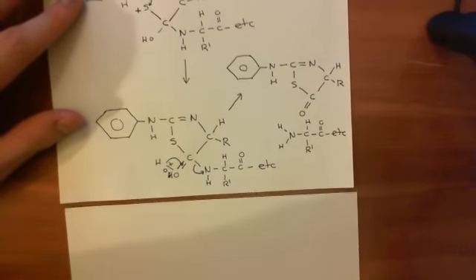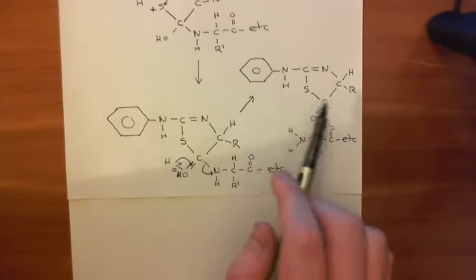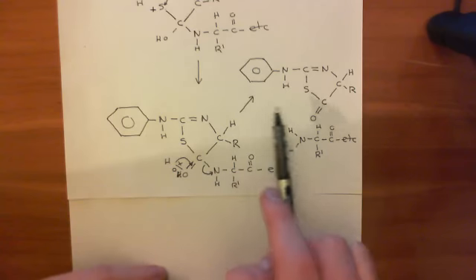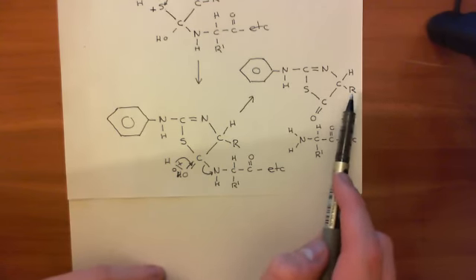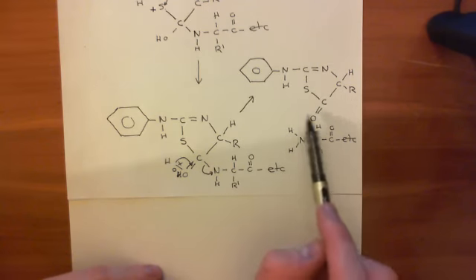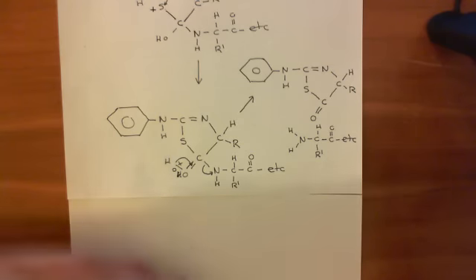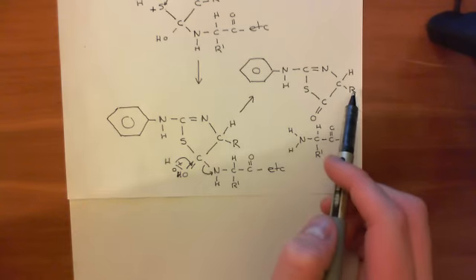So what we're now going to do is use this molecule here in order to analyze what that first amino acid was, because as you can see, this molecule is going to depend on what amino acid was in that first position, because we have this R group here. So it's going to be different depending on what that first amino acid in the polypeptide was. And therefore we can use the different chemical properties of this molecule to determine what that first amino acid was.